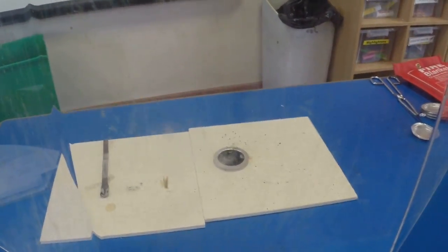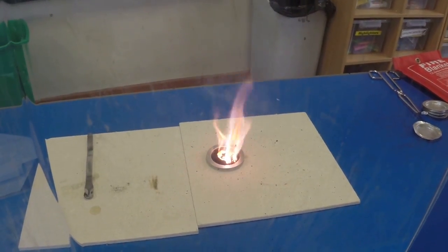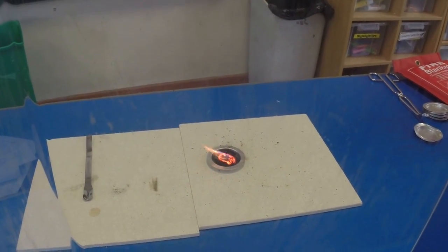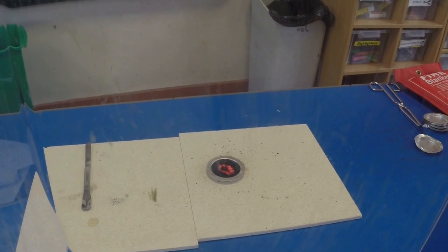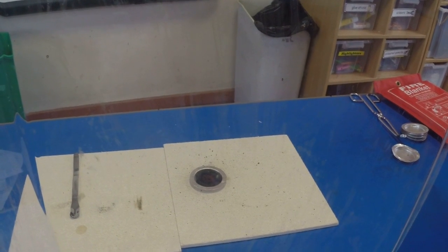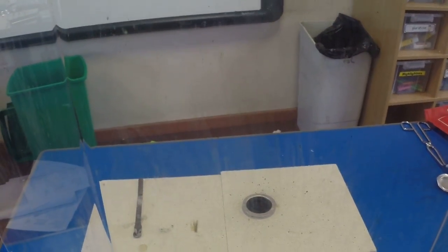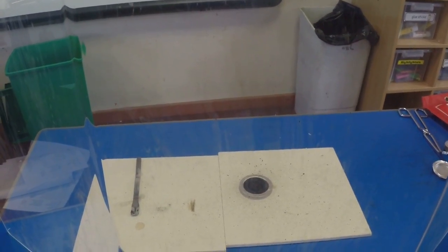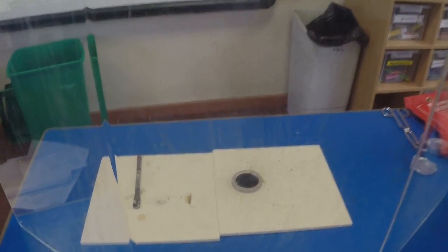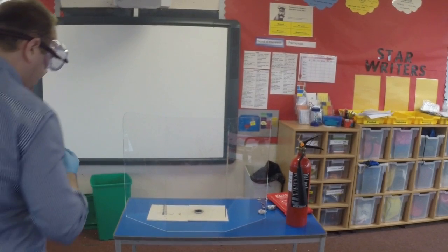So straight away, we've got the production of a gas there. And that alone will probably capture the kids' interest, but very quickly, we get this quite impressive purply lilac flame coming off. So we have the production of heat and the production of light there, and we can see the gases coming off too. Now this doesn't need to be done in a fume hood. If you have a fume hood, excellent, but it's not required. The majority of the gas there is just carbon dioxide, some trace amounts of other chemicals as well, but generally pretty safe. So fairly energetic, fairly visually engaging, and the kids absolutely love it.